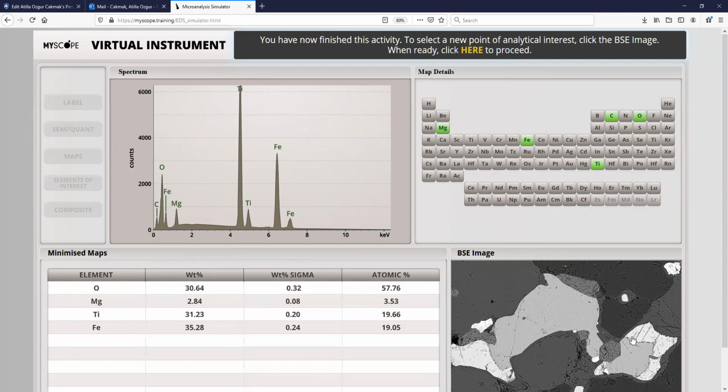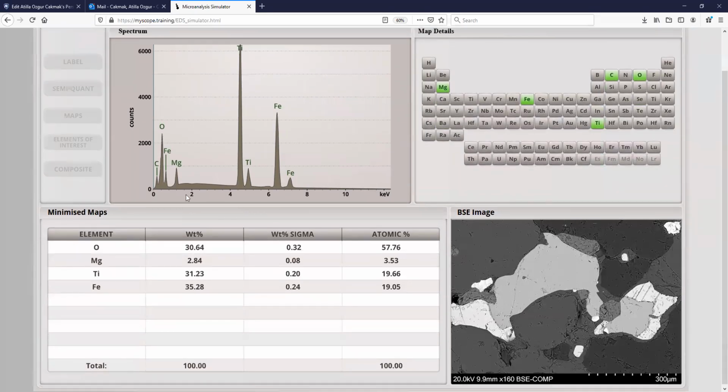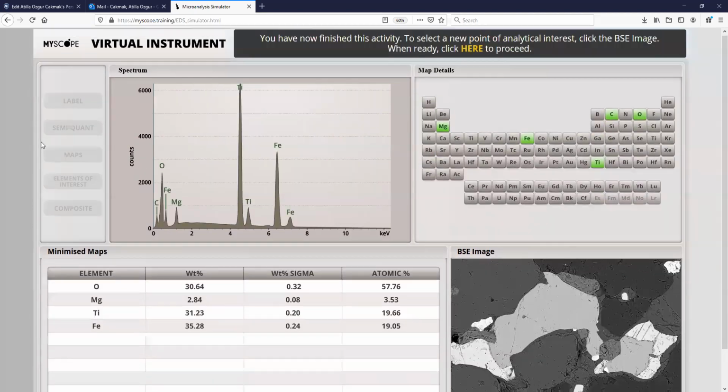And I can choose different spots on the same sample and analyze them, and let my students see and understand how this EDS is working for us to understand the chemical components of the materials. So the students can see, in summary, secondary electron emission, backscattered electron emission, and also the EDS analysis, and understand it within the main framework of scanning electron microscopy.